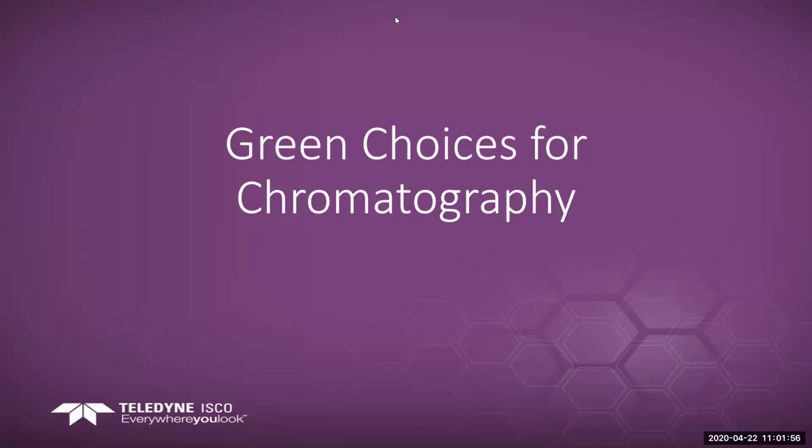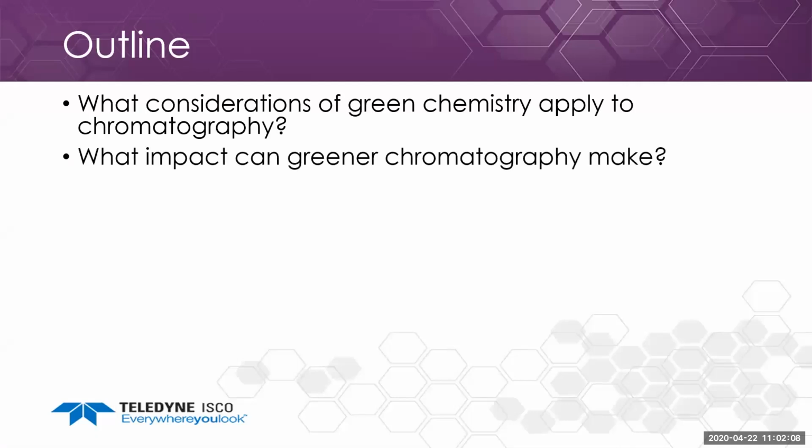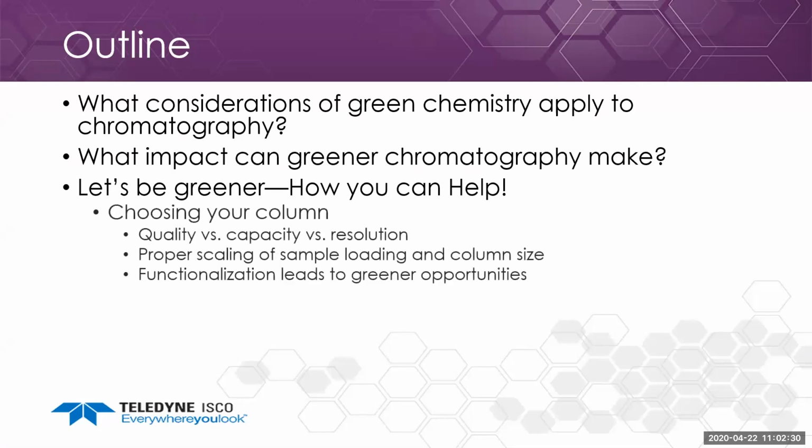So today we're going to be discussing green choices for chromatography, and specifically some green solutions for flash and prep chromatography. The outline for today's talk is we're going to be discussing what considerations of green chemistry we can apply to chromatography, what impact greener chromatography can make, so if we make small changes, how they add up in the industry and how we can make a major contribution to the footprint, how we can be greener and how you can help.